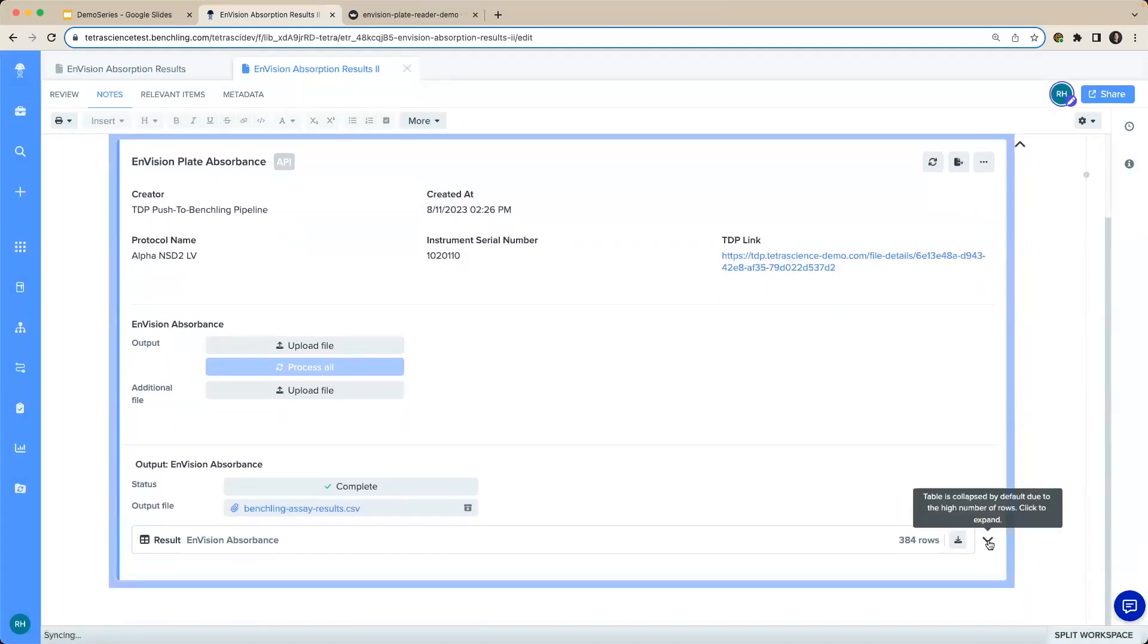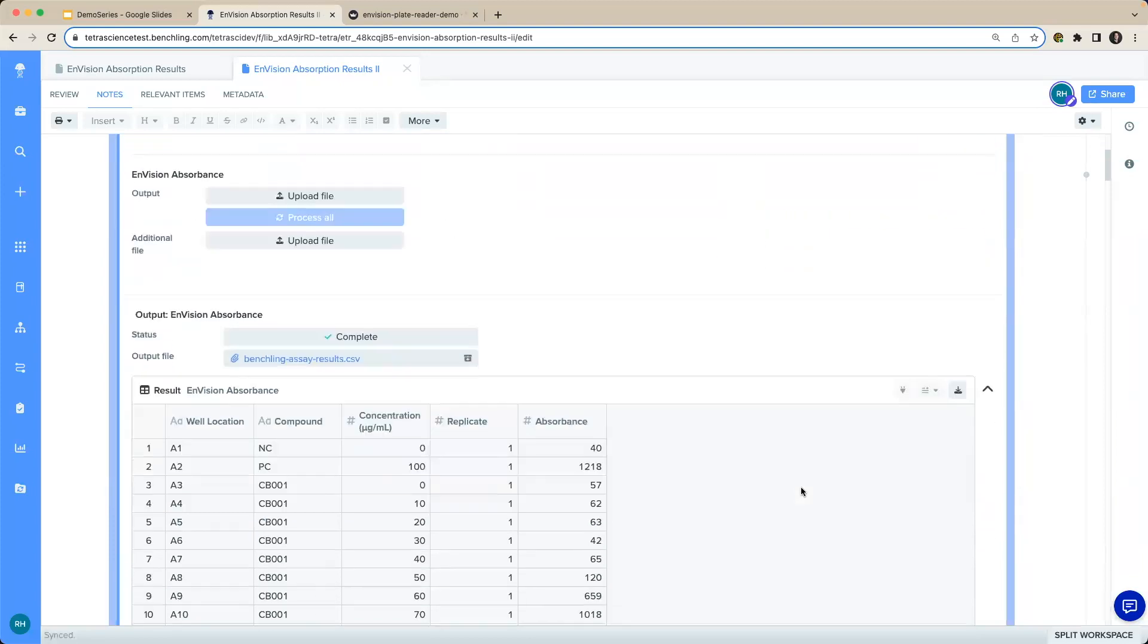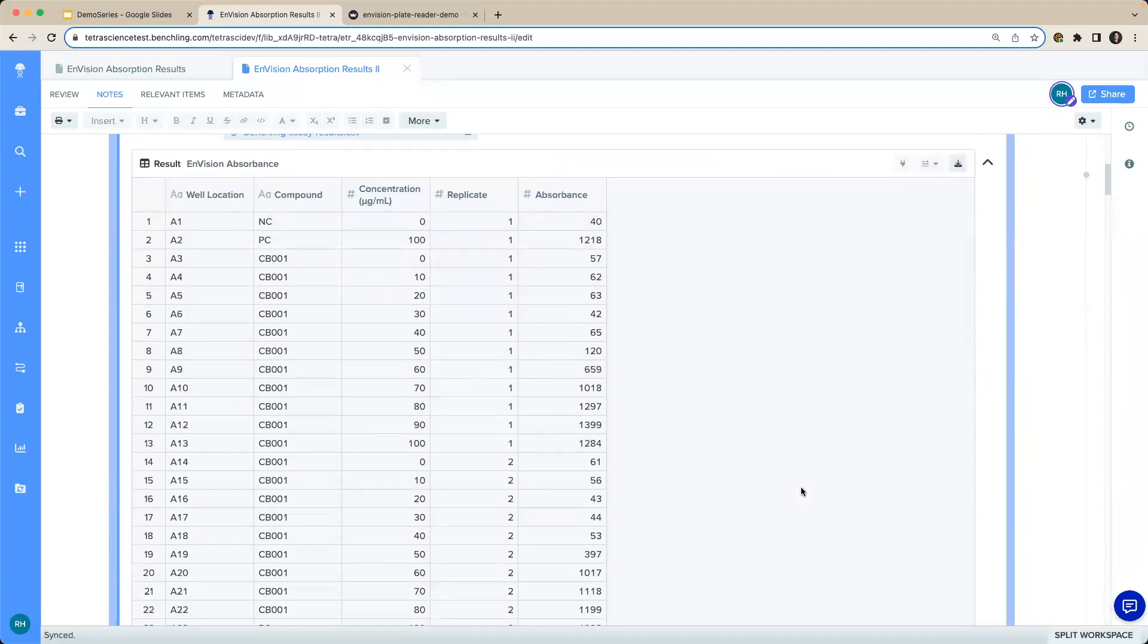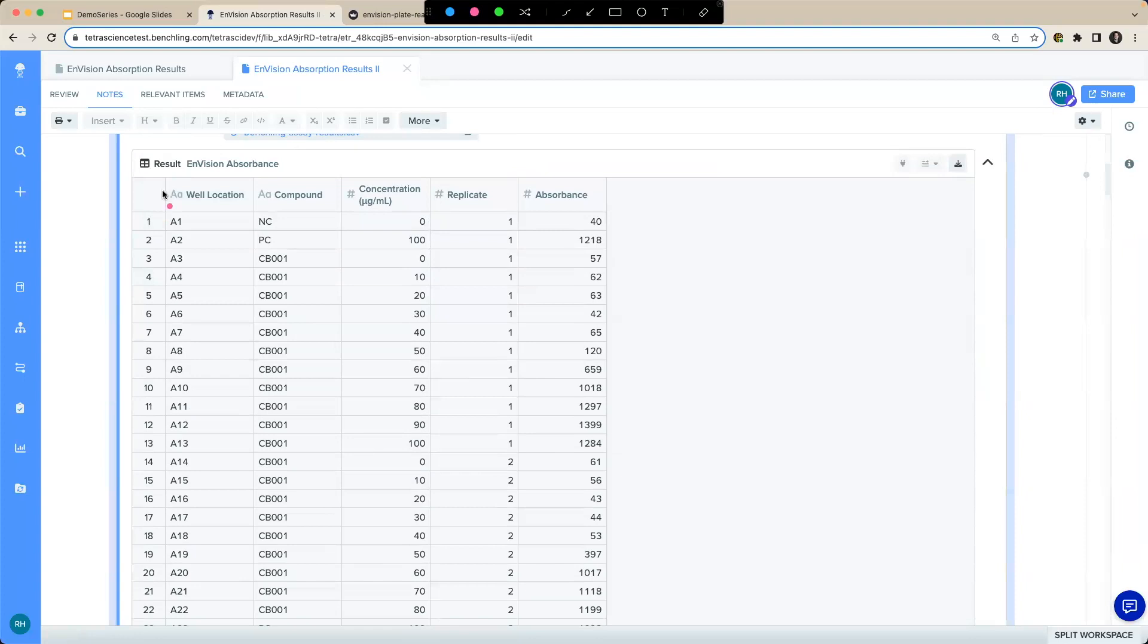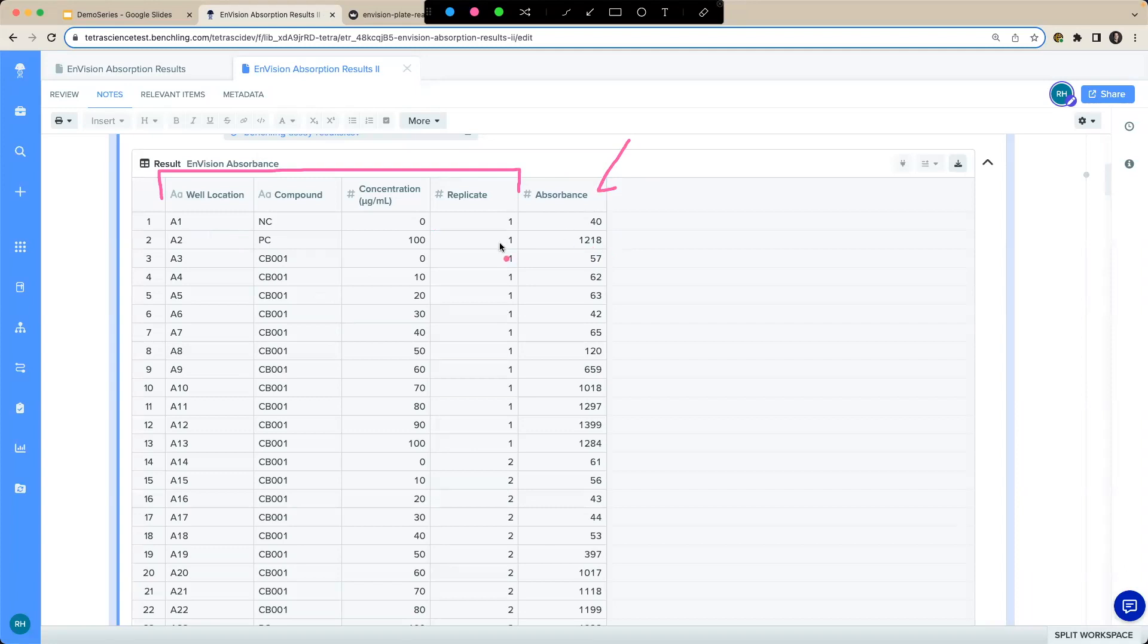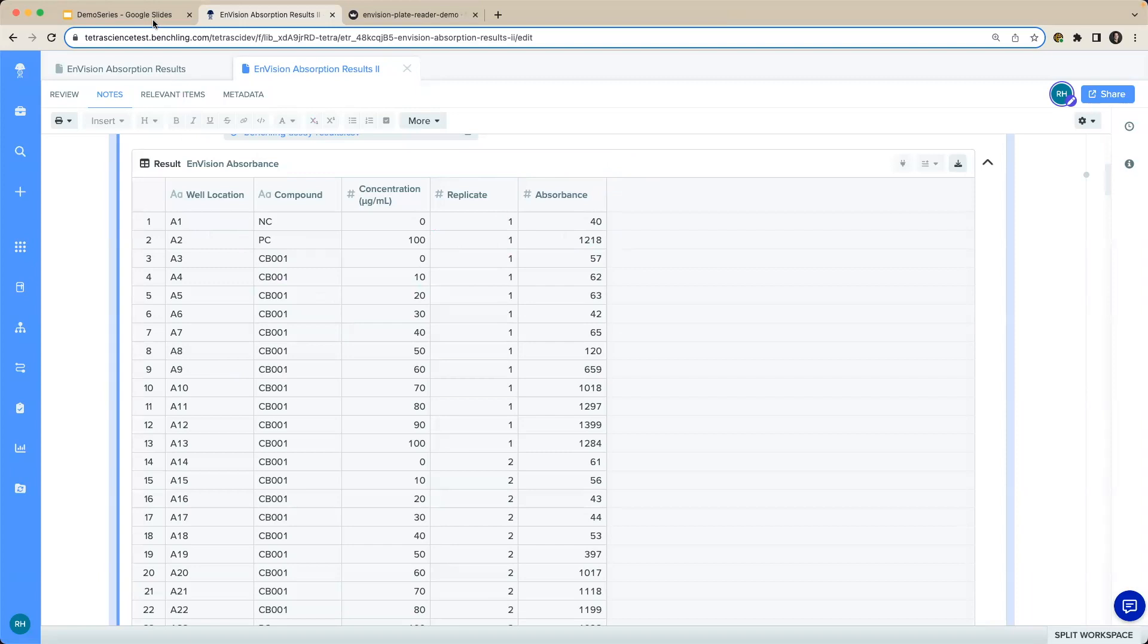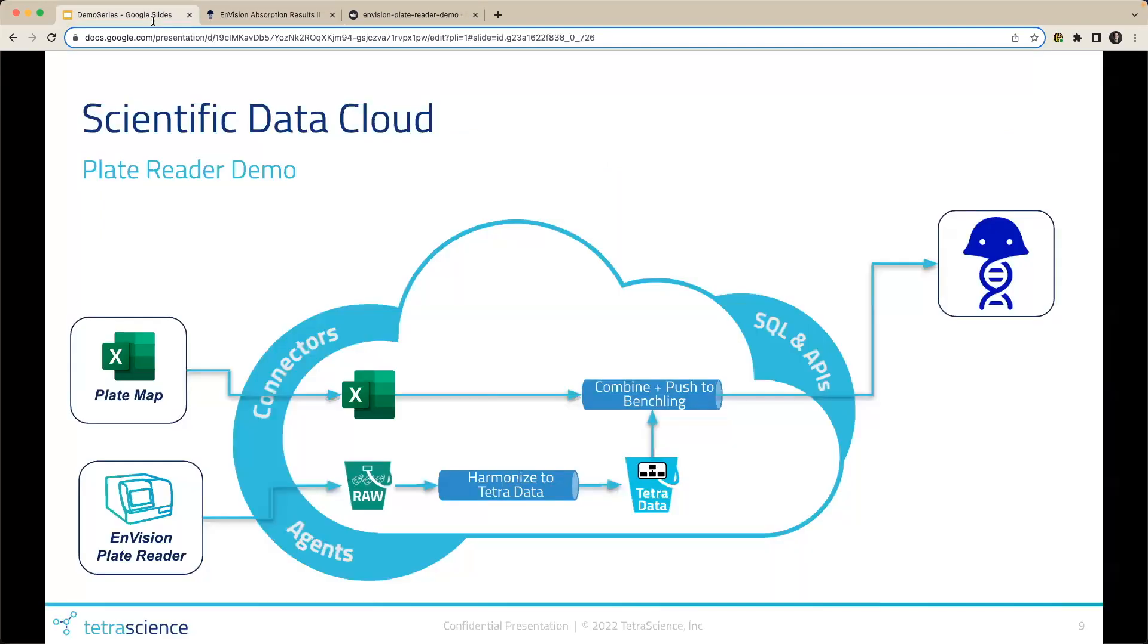I'll scroll down. And I can see all my absorbance information in this table, where I have the information from my plate map in my first four columns automatically associated with my plate reader instrument results, all in one table, easy for the scientists to consume. In conclusion, the Tetra data platform was able to automate the correlation of our plate map with our Tetra data and push those results to Benchling with very little manual interaction.